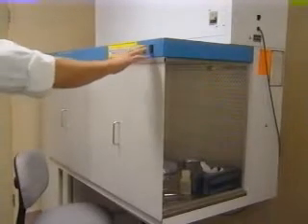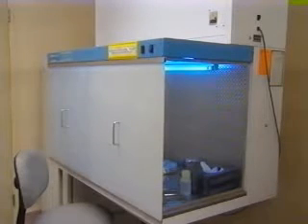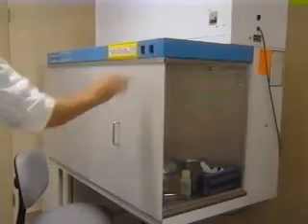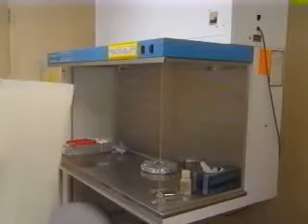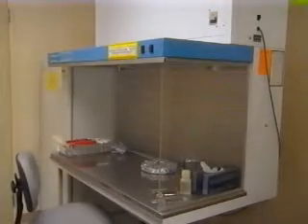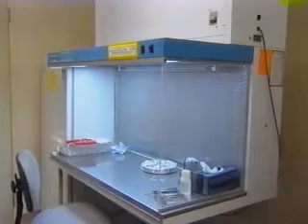The laminar flow cabinet, or transfer hood, is a cabinet in which air sucked from outside has passed through very fine filters called HEPA, which stands for high efficiency particulate air. This filtering system ensures that the airflow over the working bench is completely sterile. In fact, a HEPA filter catches any particle bigger than 0.3 micron in diameter.